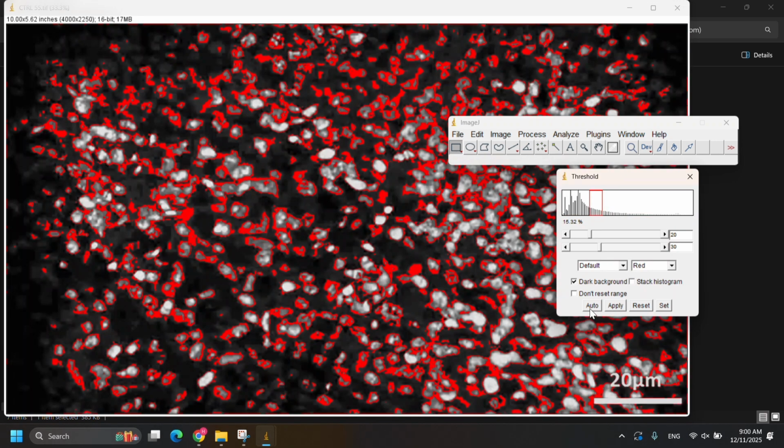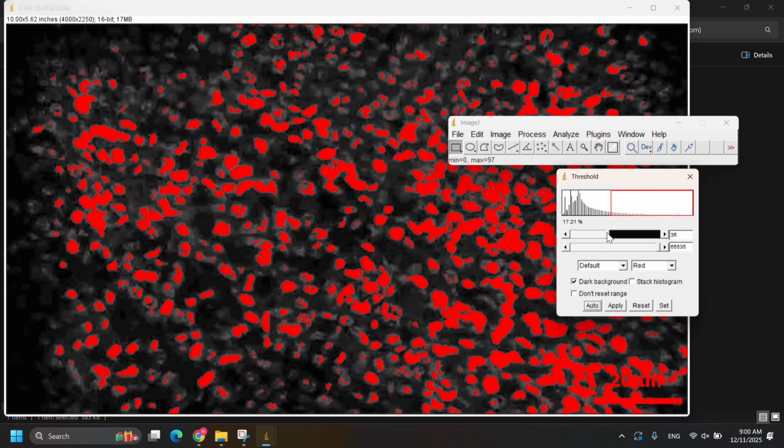Remember, for a series of samples, if you want to compare them, as far as possible, use the same variables, threshold or other choices. Try auto, it usually gets better results. Then click apply.